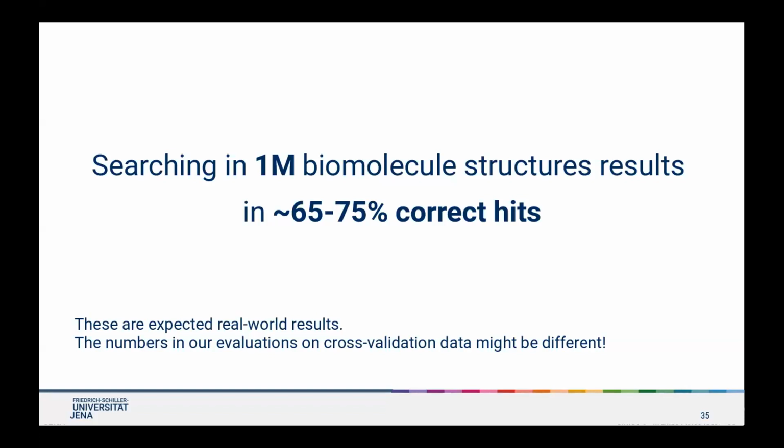Just to make a comment here, in our publications, we usually try to evaluate the method and not the real world performance, and compare machine learning methods. You cannot just annotate any kind of data, so we do cross-validation there, and that's why the reported numbers in the publication usually differ quite a lot.